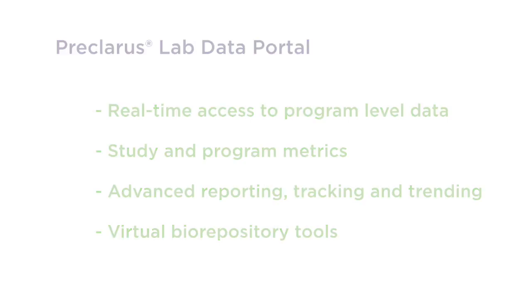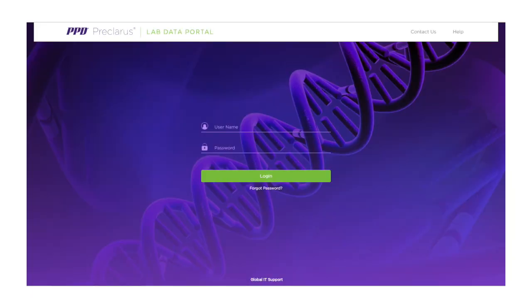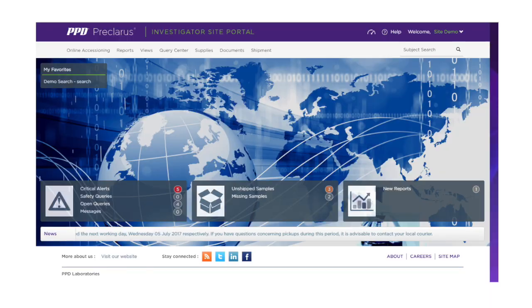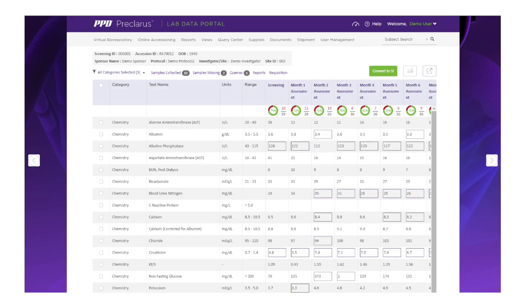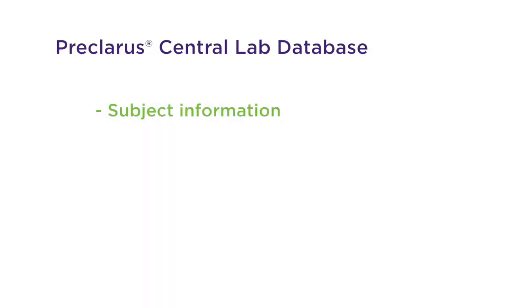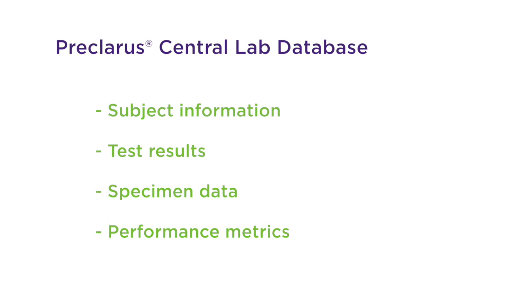The Preclarus Lab Data Portal provides visibility to study data contained in the Preclarus central lab database, including subject information, test results, specimen data, and performance metrics.